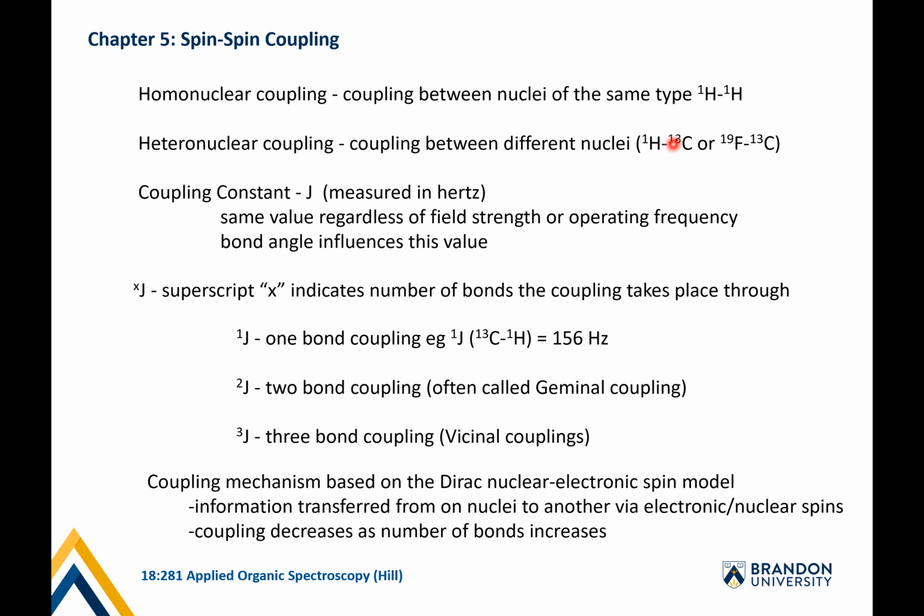It makes the NMR more simple because everything shows up as a singlet, but it also provides the nuclear Overhauser enhancement for CH3, CH2s, and CHs and that sort of stuff. There is some other sort of coupling, and a popular one is fluorine. It's NMR active, and it couples with both carbon and hydrogen. If you ever have fluorine in your molecule, it's very interesting, actually.